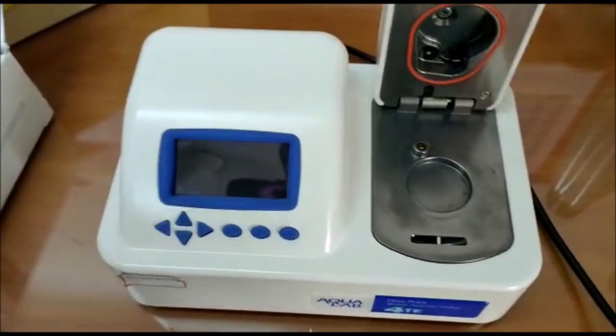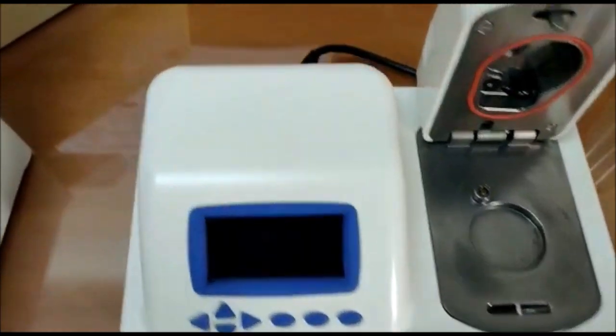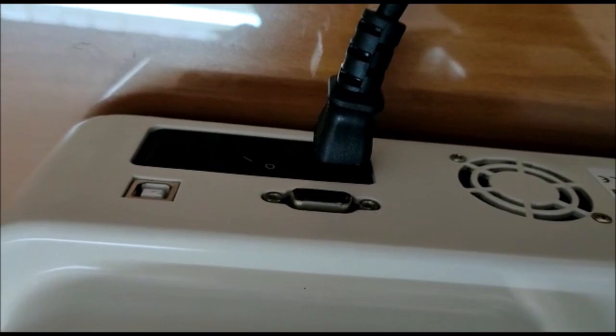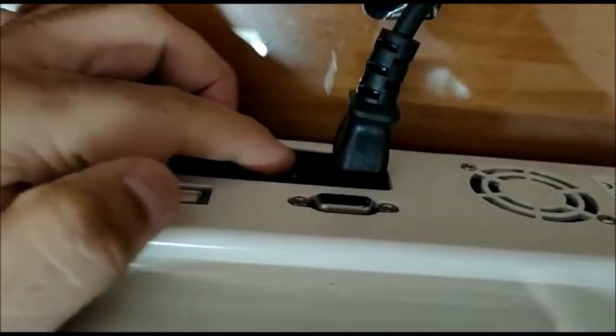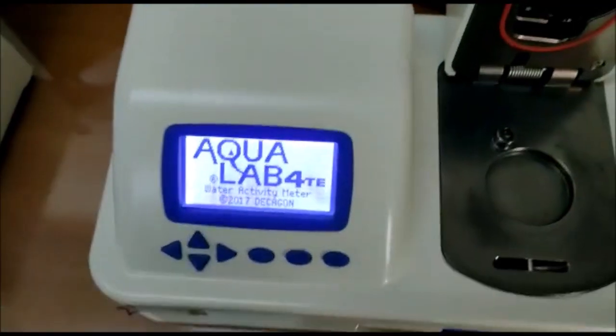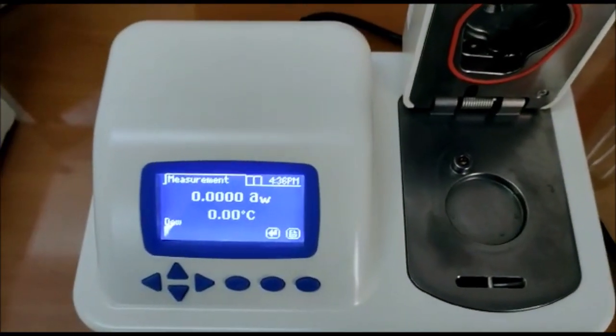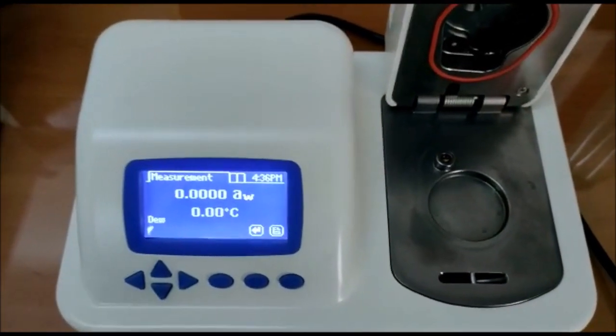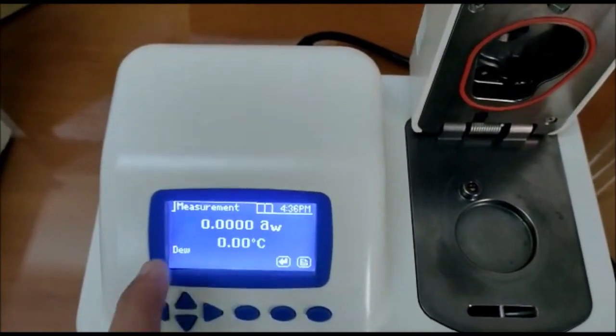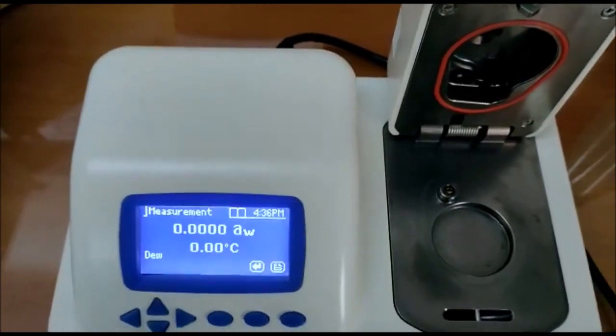Moving on to the instrument. This is a plug and play instrument. You only have to attach the power cable to it right here and you have to switch it on like this. The first screen which will appear here is measurement screen which shows the water activity up to 4 decimal places and temperature.